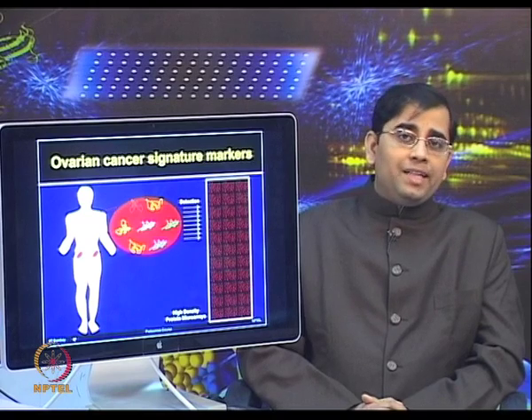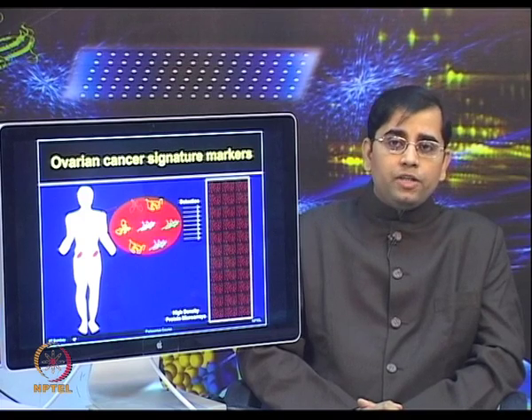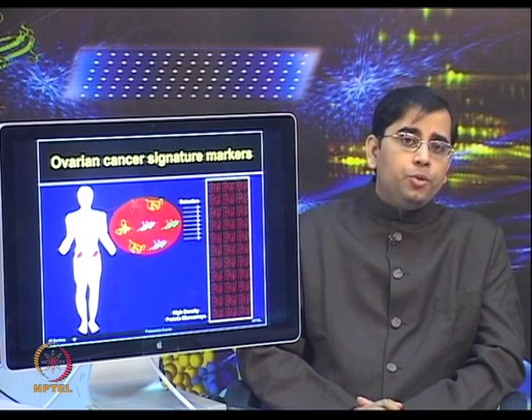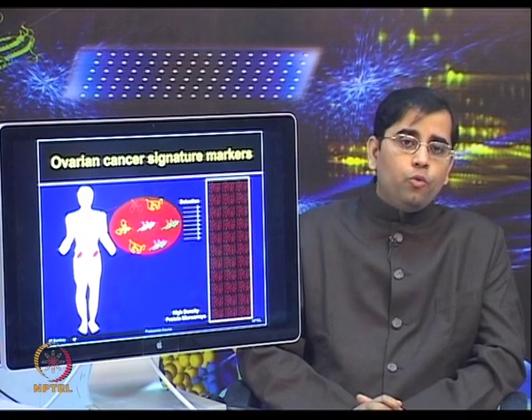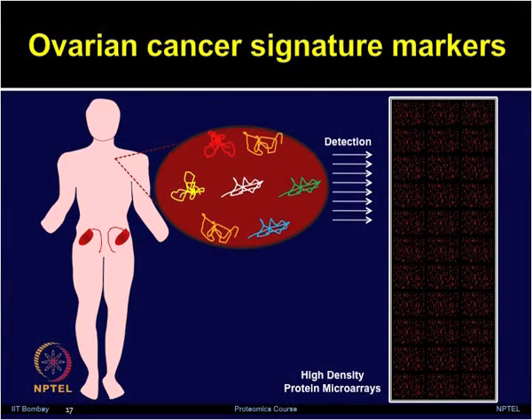So, overall this was an impressive study which revealed that the 3 candidate tissue markers, when immunostained, can produce a very robust signature of ovarian cancer in the tissue sections. Although the authors used serum, and the motivation was to develop serum or blood based assays, they thought that at least the robust signature in the tissue indicates that these proteins are overly present in the serum sample, and probably this type of markers can be used for blood based or serum based assays.